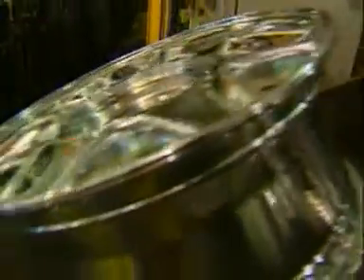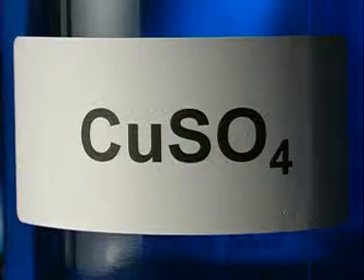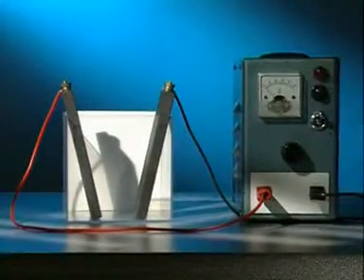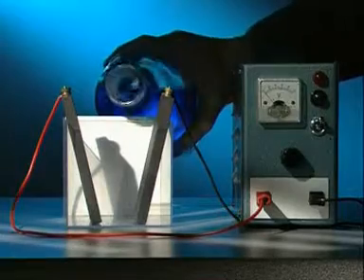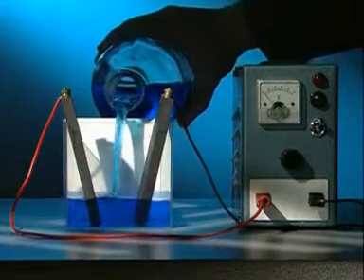Electroplating is used to protect metals from corrosion and make articles more attractive. Copper plating is easy to set up in the laboratory. All you need is a solution of copper sulphate and a method of passing electricity through it.